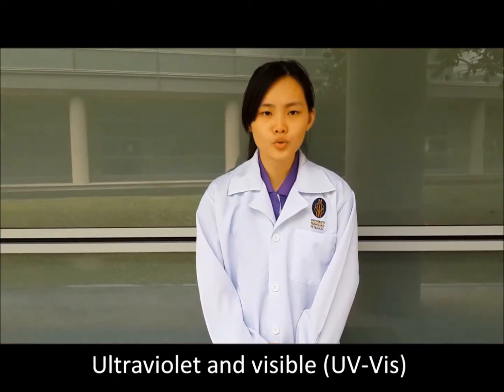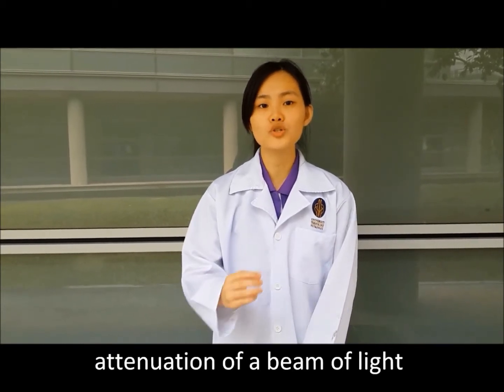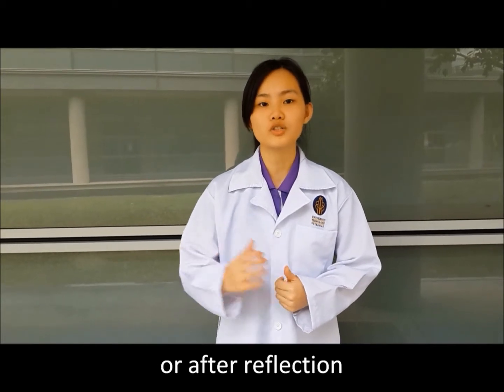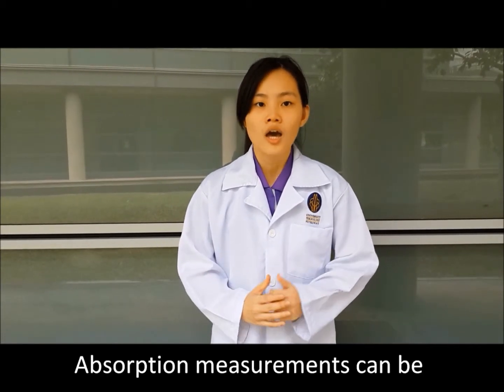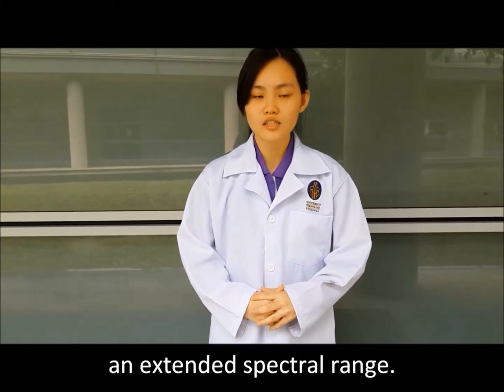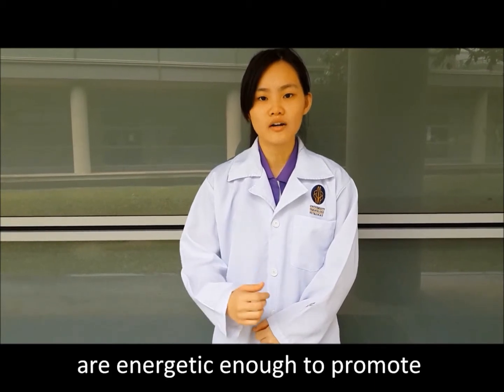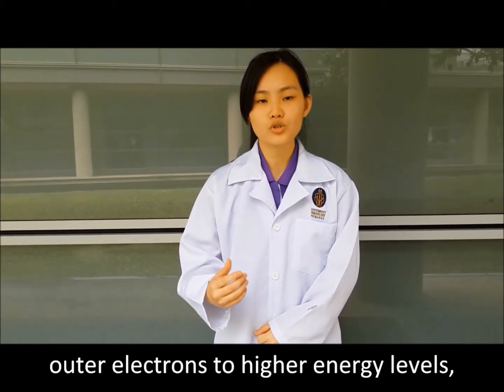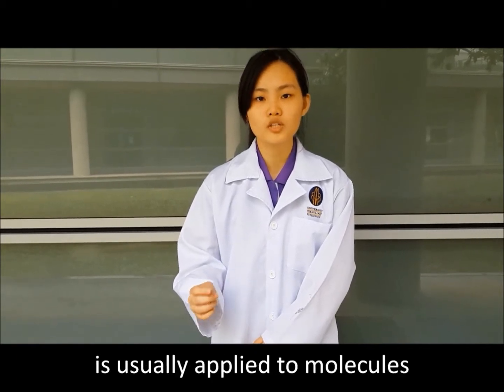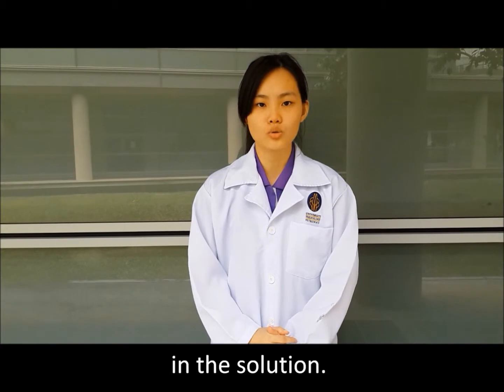Ultraviolet and visible UV Vis absorption spectroscopy is the measurement of the attenuation of a beam of light after it passes through a sample or after the reflection of a sample surface. Absorption measurements can be a single wavelength or over an extended spectral range. Ultraviolet and visible light are energetic enough to promote outer electrons to higher energy levels, and UV Vis spectroscopy is usually applied to molecules or inorganic complexes in the solution.